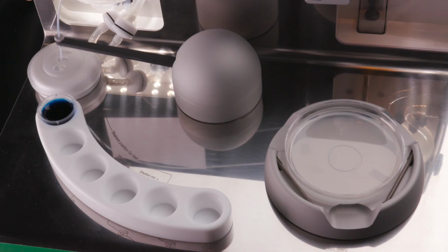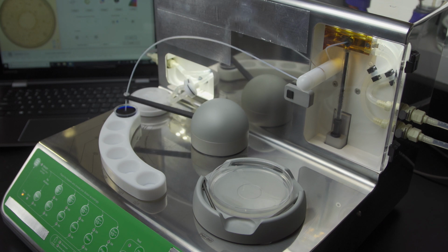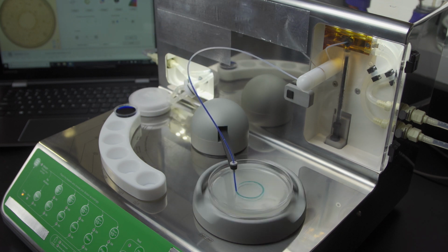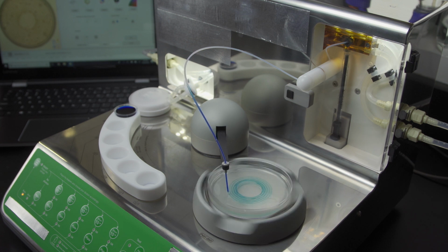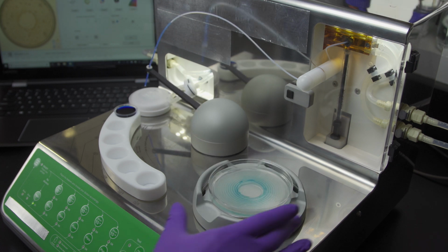Well, how does your R2A method differ from more manual methods? I see you have some fascinating technology here. Yes, it's very sophisticated technology that we recently adopted. This technology is largely automated, which is extremely important because it eliminates most of the human error in testing. Additionally, it can plate and count with higher accuracy and precision than most manual methods.